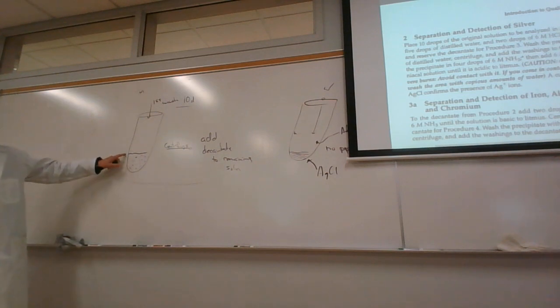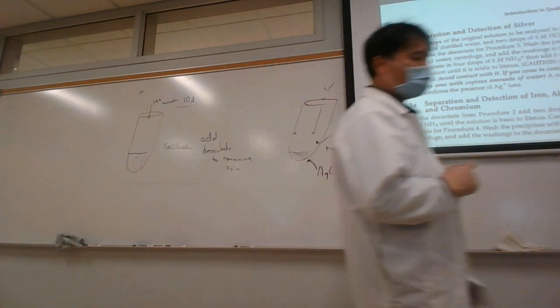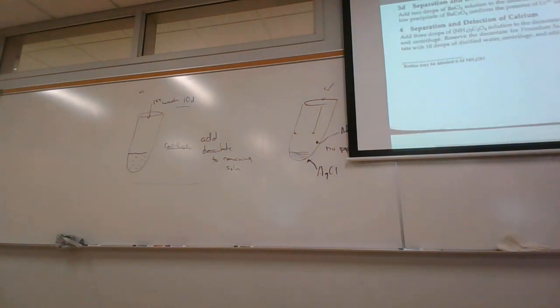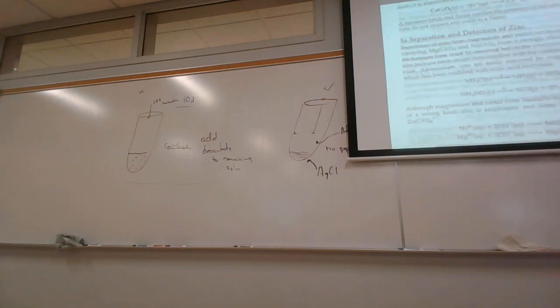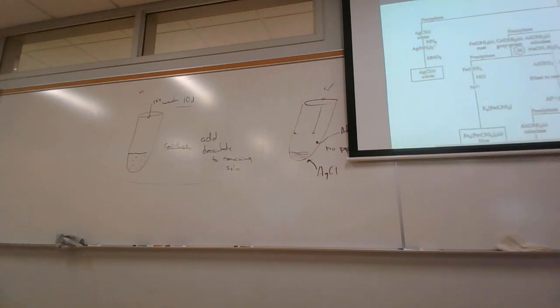So the first wash is going to consist of 10 drops. Centrifuge, decant, and combine the wash. Go back here.